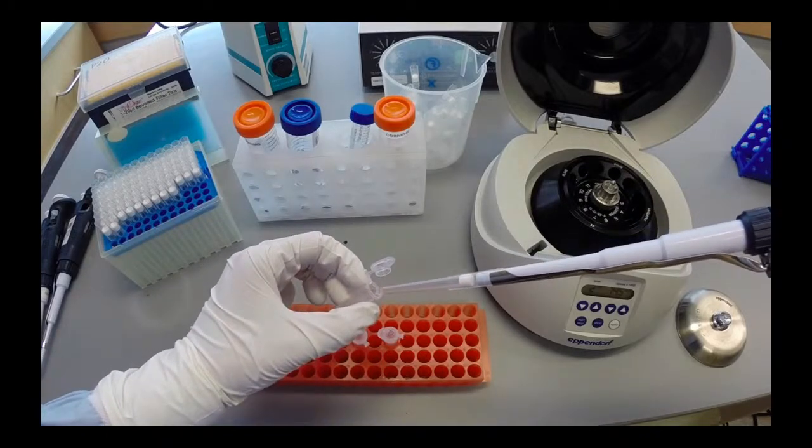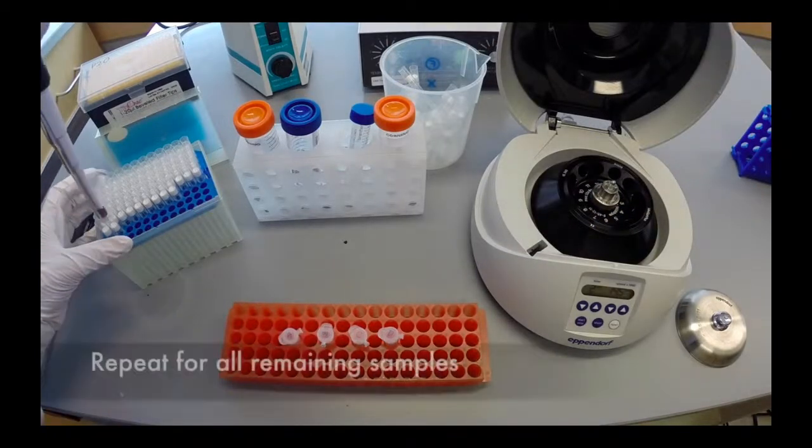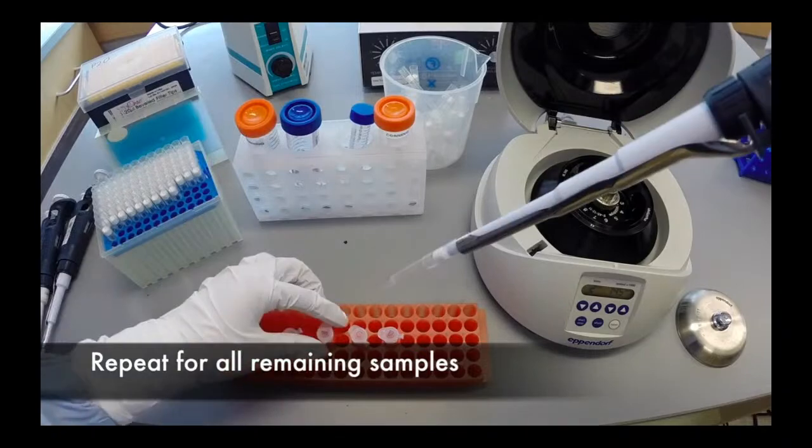Do not mix this solution, as it is imperative that the pellet is not disturbed. Repeat this process for all remaining samples.